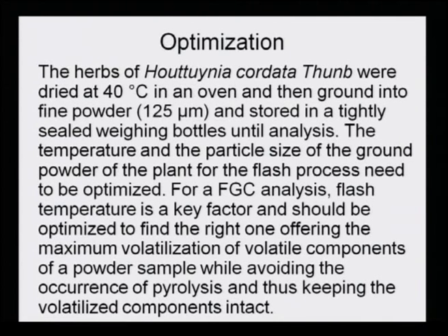offering the maximum volatilization of volatile components of a powder sample while avoiding the occurrence of pyrolysis, and thus keeping the volatilized components intact. See, there is a very discrete difference with pyrolysis, which breaks down the compound completely. So, the flash temperature should be just optimum to keep the compound alive, and the compound should not get hampered.